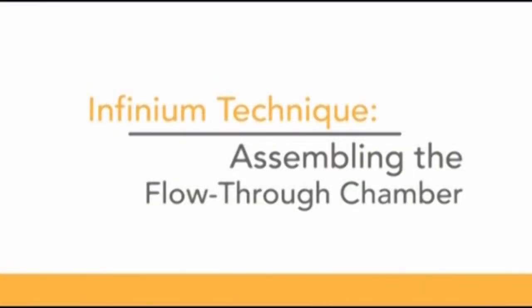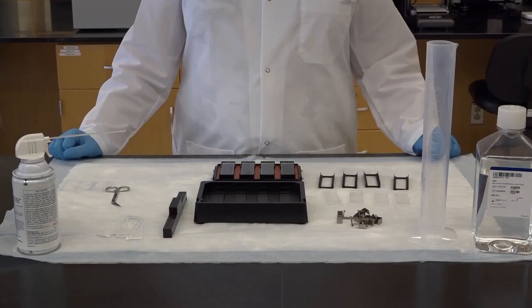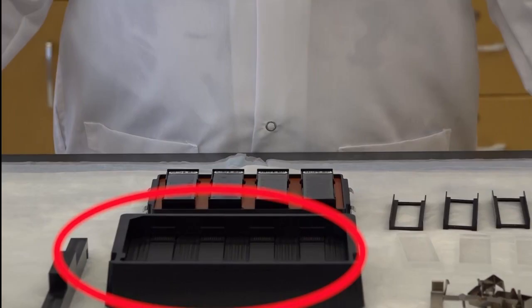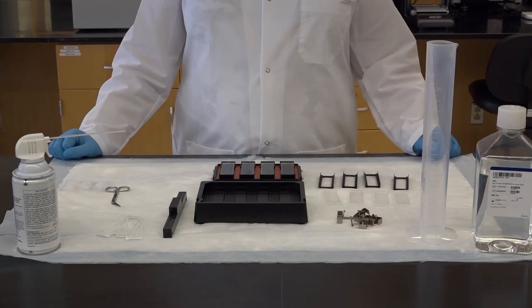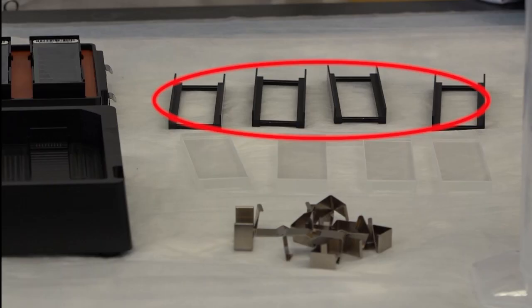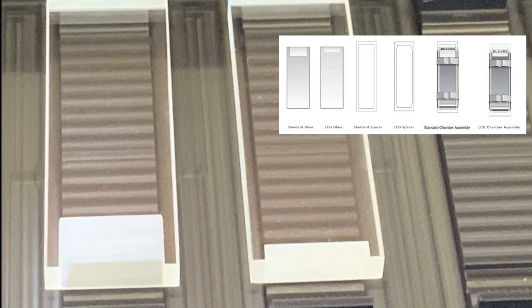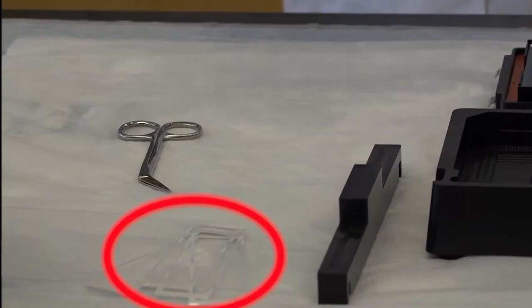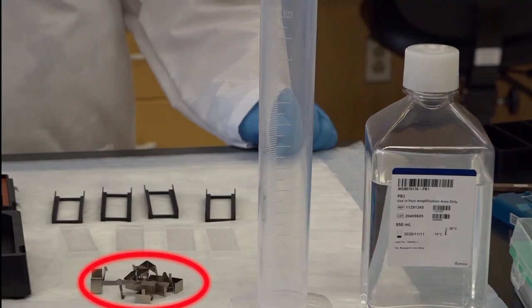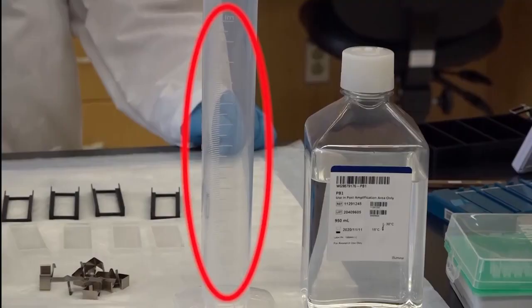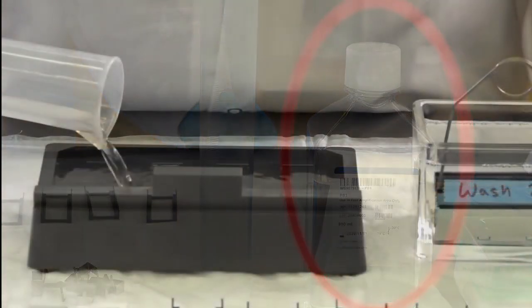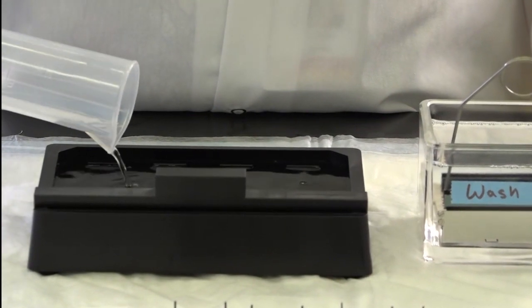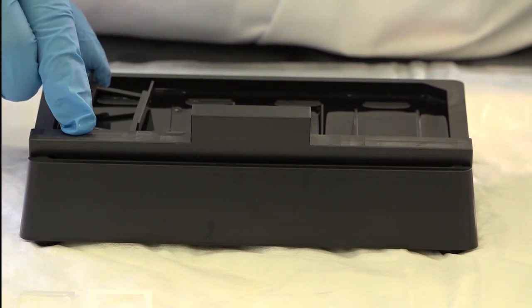The technique for assembling the flow-through chambers for each bead chip will be detailed. This process occurs just prior to the extend and stain protocol step. To assemble flow cells for four bead chips, you will need an alignment fixture, absorbent bench pad, scissors, four black metal frames, four glass back plates—being sure to confirm you are using the correct glass back plates for your assay—four plastic spacers, eight metal clamps, a compressed air duster, graduated cylinder, and Illumina wash buffer. First, place the black frame in the grooves and fill the alignment fixture with the directed volume of buffer as described in the EUCs.